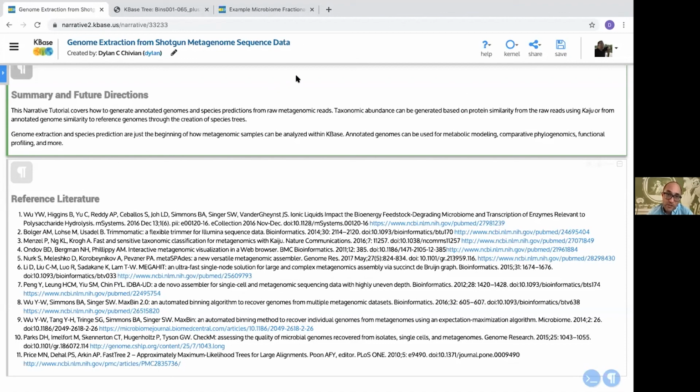However, it's only a partial picture of the microbiome. Sequencing is only a partial picture of the microbiome, right? We are not sequencing comprehensively every cell to the point where we get the full genome out for it. We get as much sequence as we get, and anything that we didn't sequence, we don't see, but it's still there, right? So the best we can hope for is being able to analyze all of the sequence, and each fraction of that sequence, the best we can. So high quality MAGs, the best fraction, deserve the most attention, but they're only part of the picture.